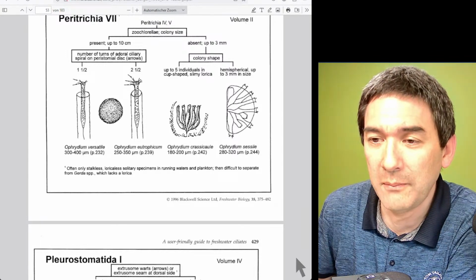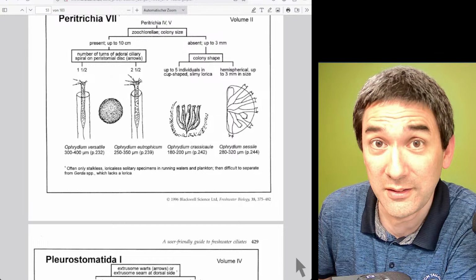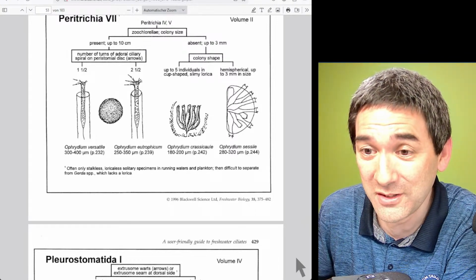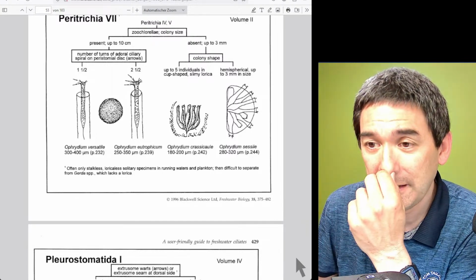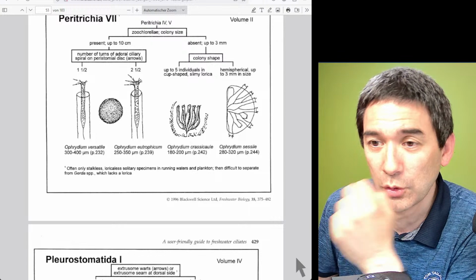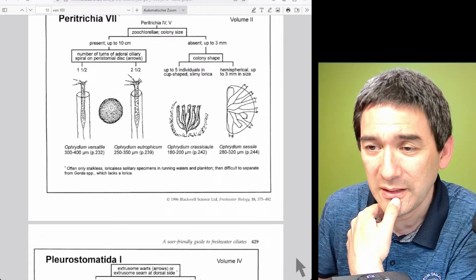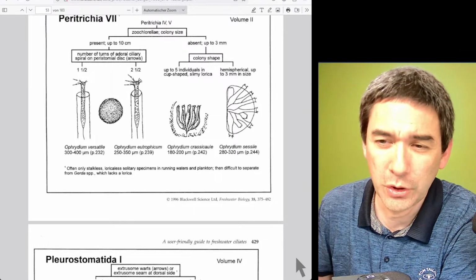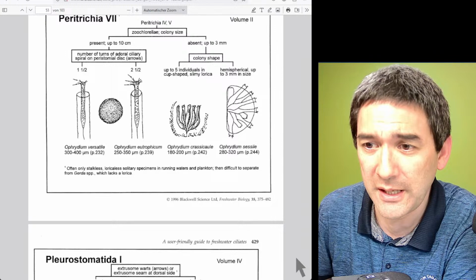I will soon receive Euparal and glycerol. Glycerol is easy to get, Euparal not. I want to mount plant cells. Do you have any advice? Does it prevent stains like neutral red or methylene blue? I don't really know so much. Glycerol is slightly acidic, so it might change the dye a little bit. Euparal should be fairly stable. You have to try it out, I would say.